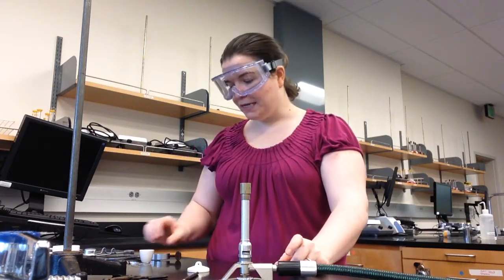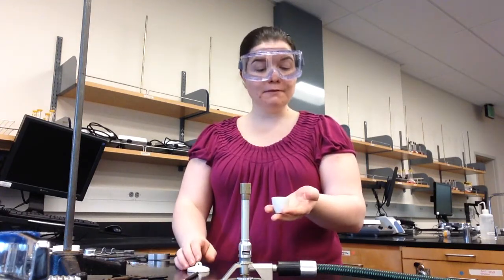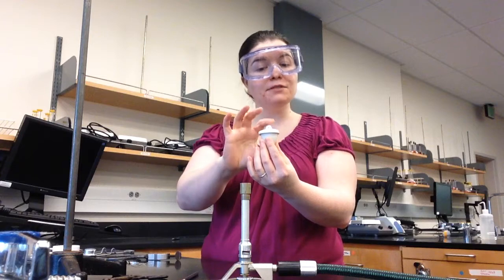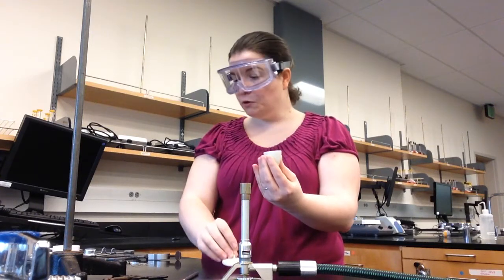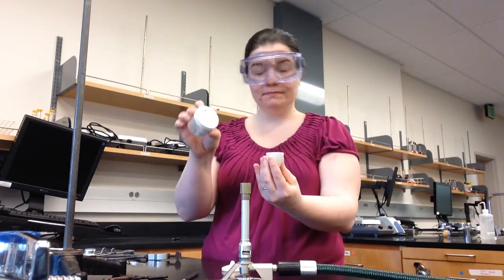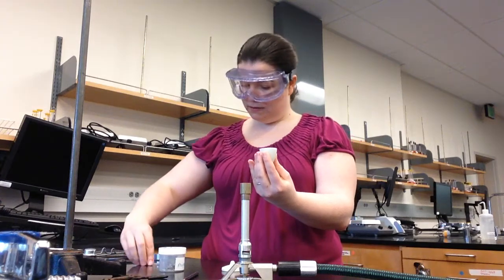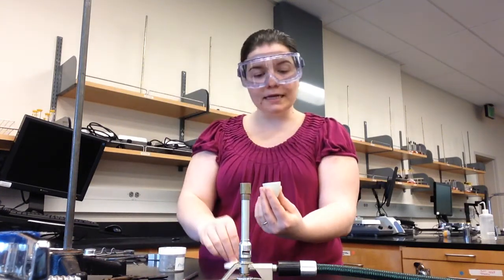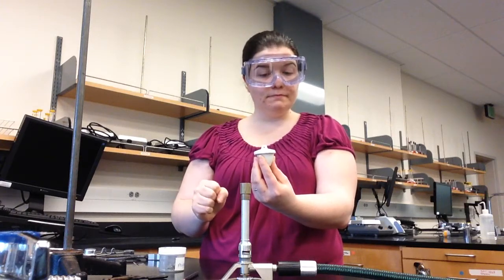Part 2 involves heating two chemicals and quantitatively measuring any changes to the mass that may occur. The first chemical you'll be heating up is magnesium. And to heat up the magnesium, we're going to use a crucible. This is a crucible, this is the crucible lid. You should first measure the mass of the empty crucible, and then add about 1/4 gram of magnesium ribbon. I'll add my magnesium ribbon to the crucible, put on the lid, and measure the mass once more.